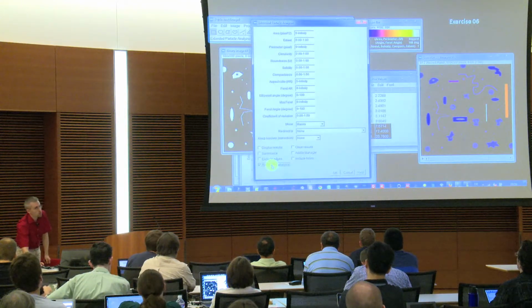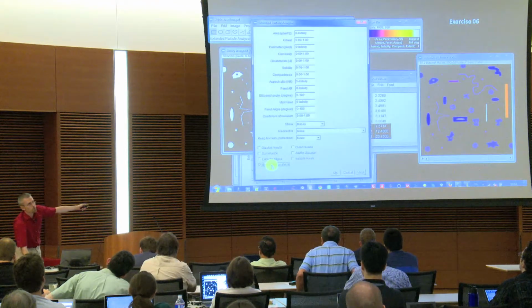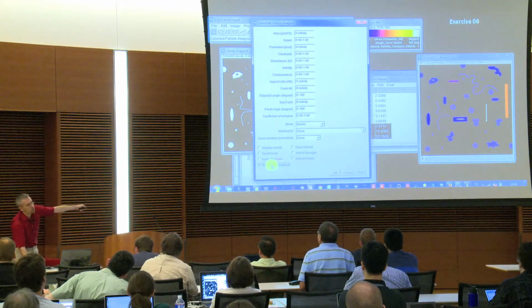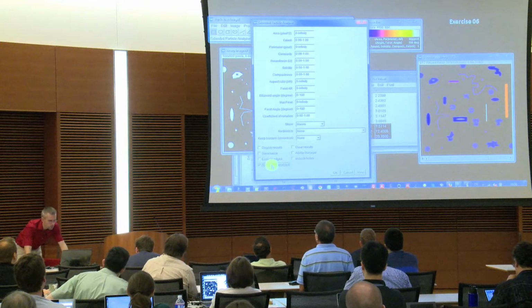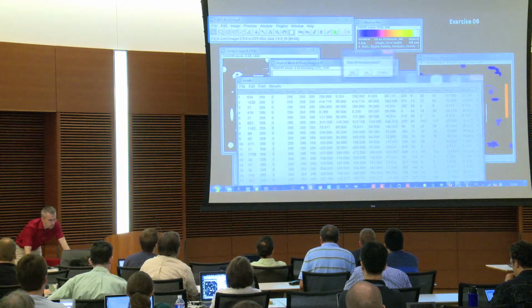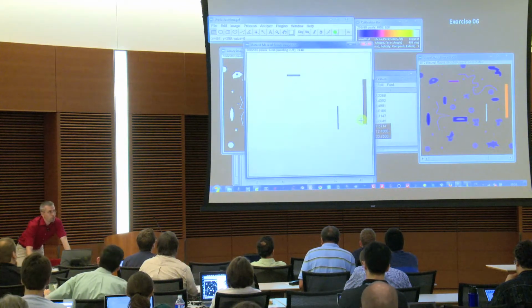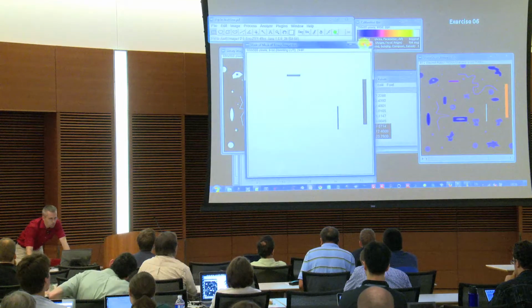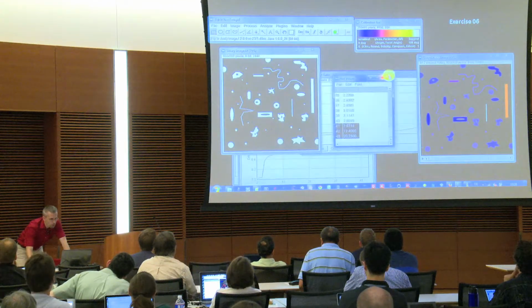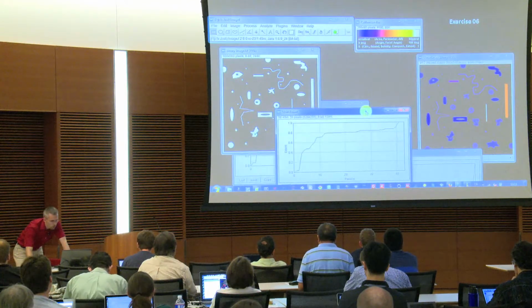And I want to reset the whole settings here because it remembers what you key in here, and that might later on be troublesome. So you can also afterwards reset that to the default values, reset this here. So now if I press OK, then you see, I get my result. So then you see that I extracted only those 3 ones where I got the parameters for. And the same I could do now, for example, for whatever. What else have we chosen here?